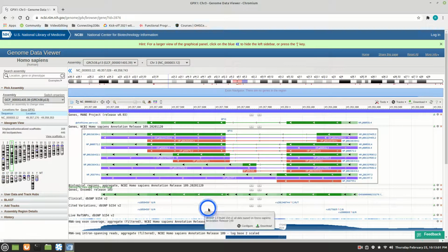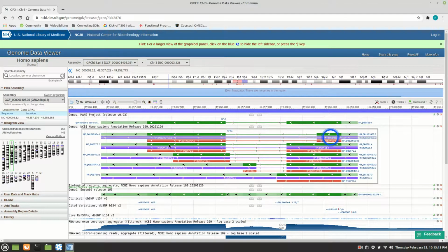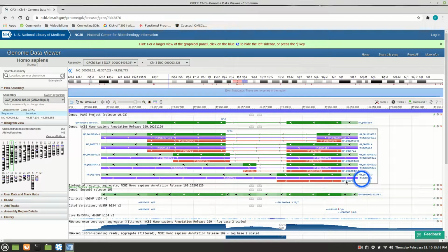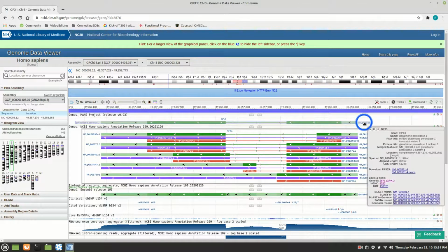and there are several ways we can do this. Now, wherever it starts here, right here, wherever all of these are the beginning of the gene over here, actually it's going in this direction. So it's starting over here. It's showing us that we're going in this direction. Genes can actually be in different directions on the chromosome. You can even have them overlapping in different directions on the different strands. But the idea here is, here's your primary sequence, and this is giving you most of the information you need.